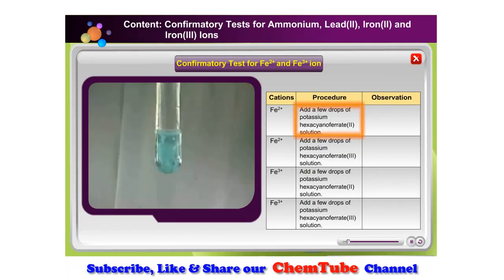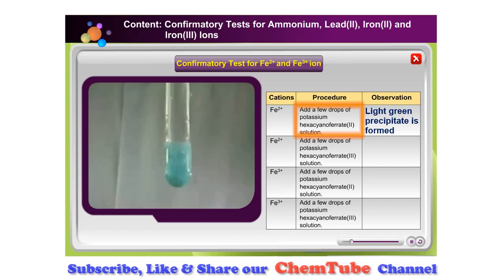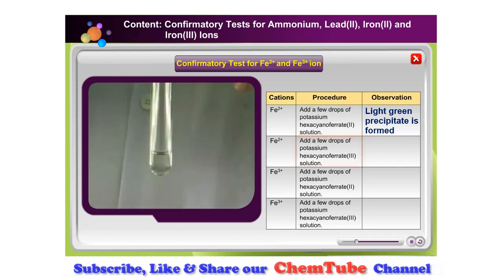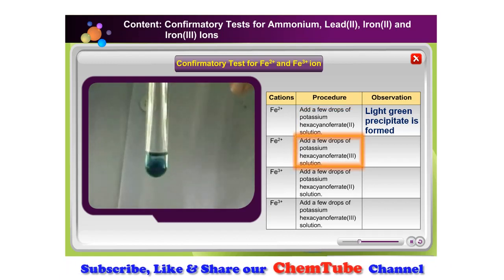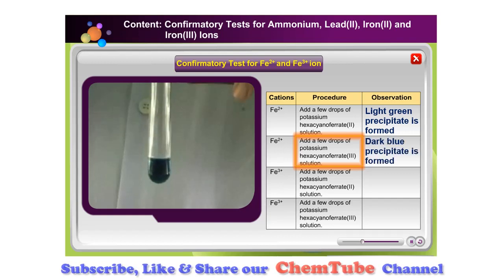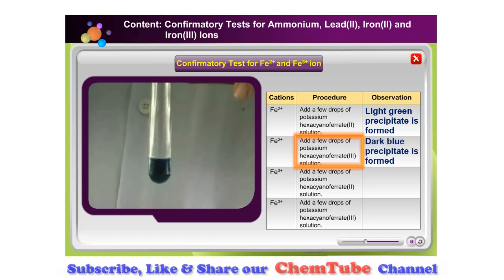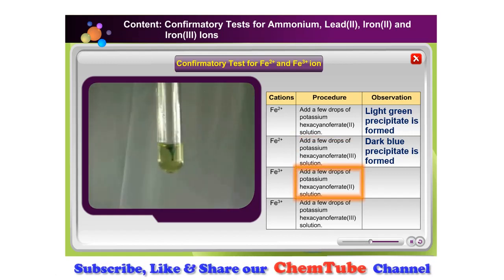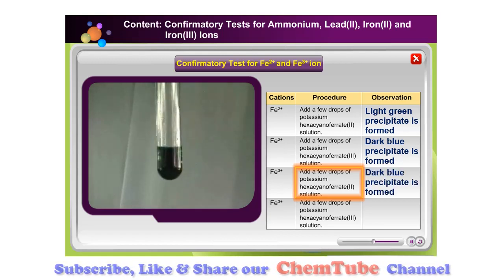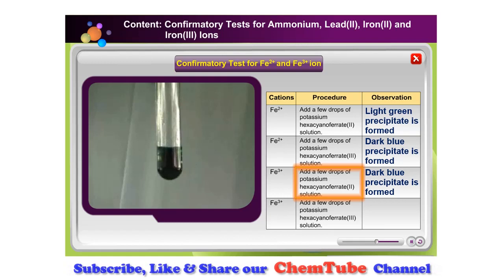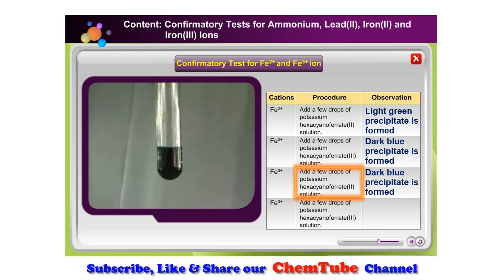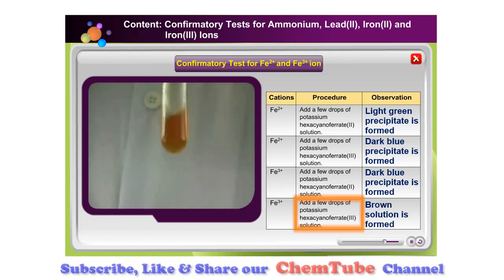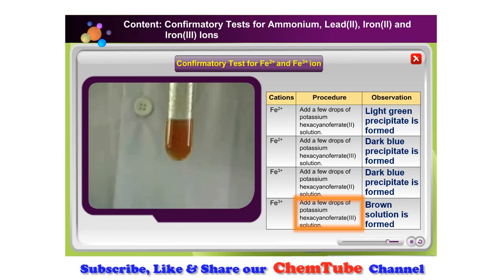Use a dropper to add a few drops of potassium hexacyanoferrate(II) solution into a test tube containing iron 2 ions. Use a dropper to add a few drops of potassium hexacyanoferrate(II) solution into a test tube containing iron 3 ions. Use a dropper to add a few drops of potassium hexacyanoferrate(III) solution into a test tube containing iron 3 ions.